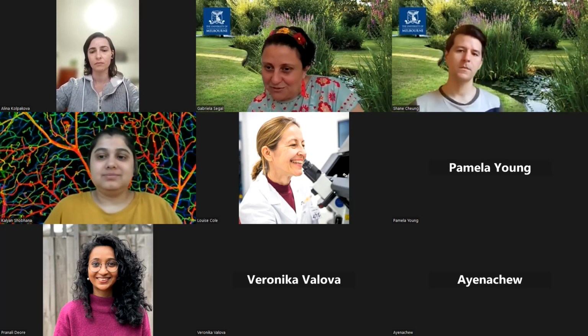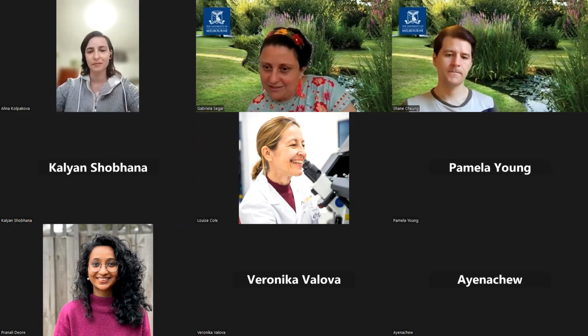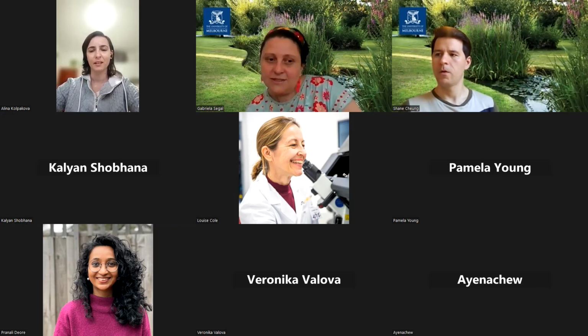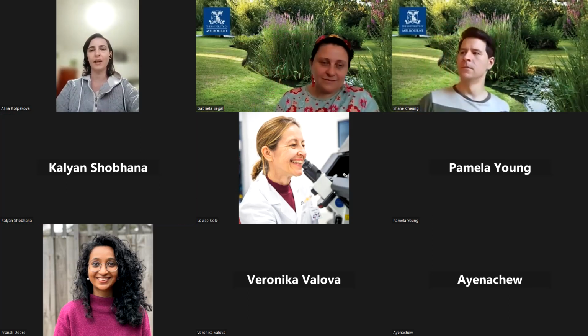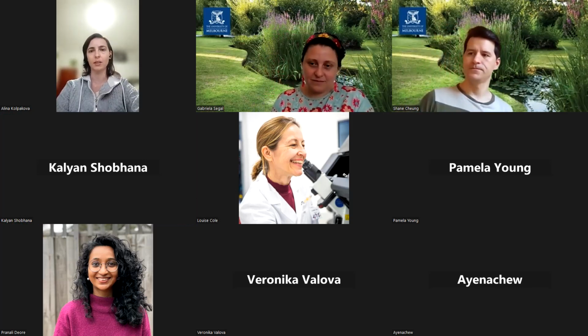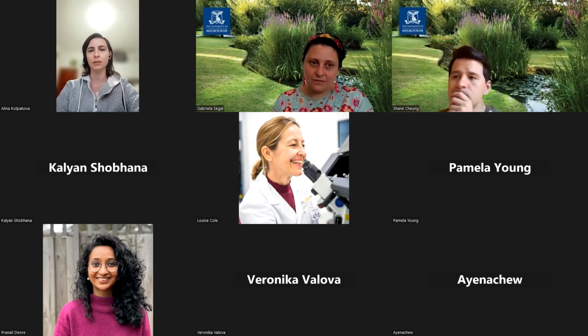There's a question for you, Elena, if you have any experience with post-expansion labeling, like fluorescence in situ hybridization, FISH. That's from Pranali. Some of the techniques, for example pan expansion and ultra expansion, use post-expansion labeling. But I used it for proteins. I didn't do in situ, but I know that some people do. The nucleic acid is supposed to be retained pretty well.